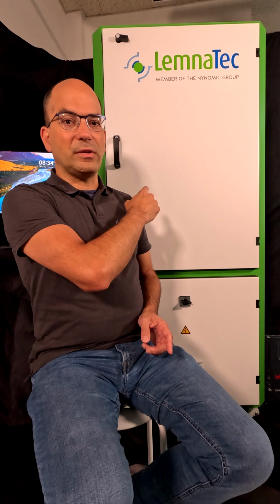It is a phenotyping cabinet that is light-tight because when you monitor bioluminescence, you have to exclude any external light. This is due to the high sensitivity camera that images very weak light signals. And you can imagine if external light comes into the box, then the imaging of luminescence is overrun by the external light. So therefore we need a light-tight cabinet.